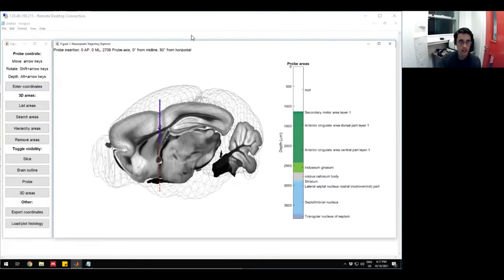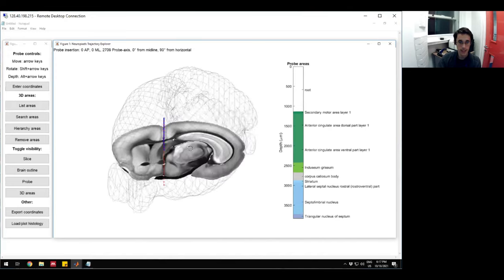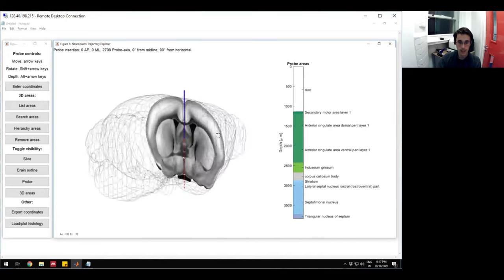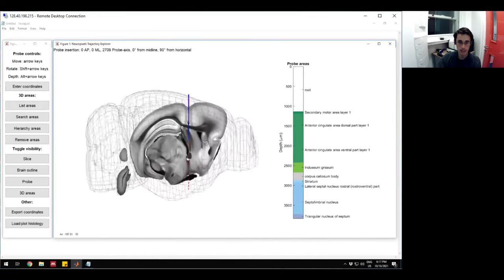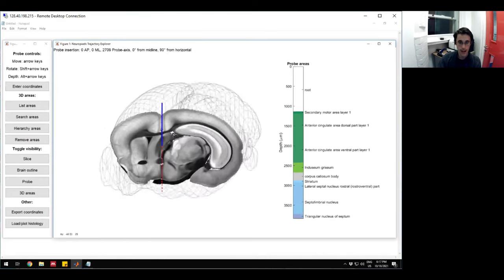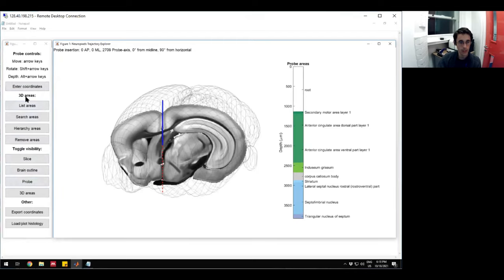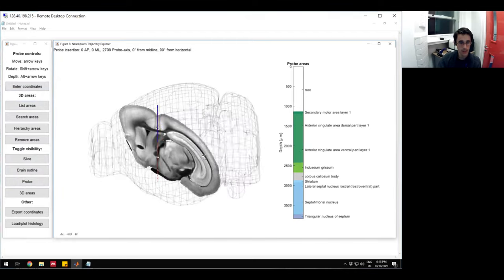I'm going to now take you to just a quick demo of what this looks like. I'm going to share now my desktop. When you open the GUI, this is what it's going to look like. You're going to have the atlas in the middle here. You're going to have the areas that the probe goes through on the right. And you're also going to have the controls over here on the left.